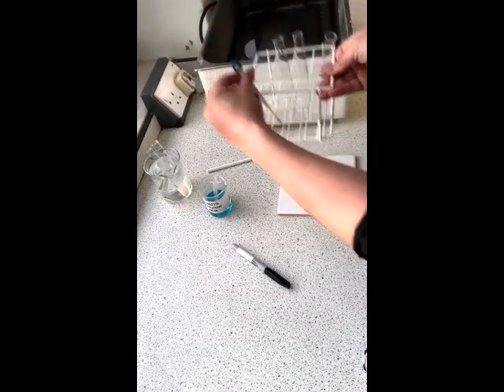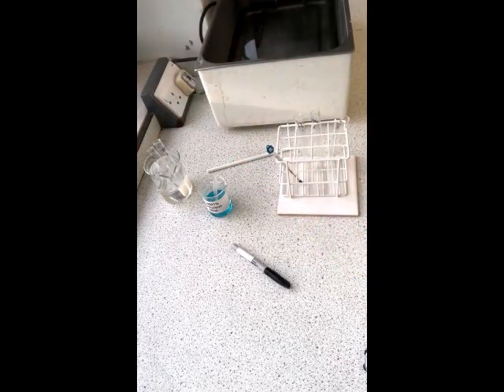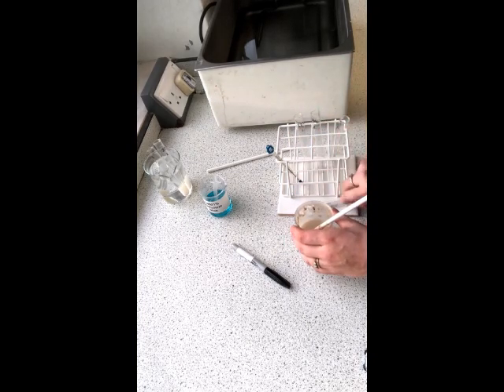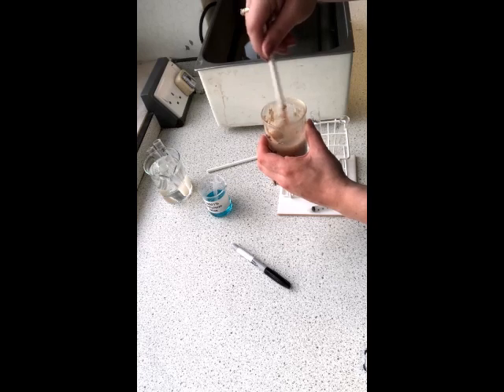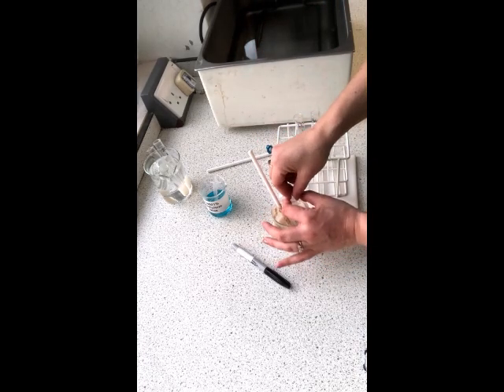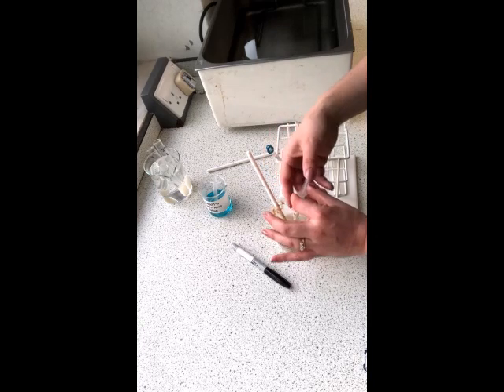So you can see the cradle is there. We will put the whole of this in the water bath. Let me get the yeast. Same system again. We're going to use a dedicated syringe for this. We're going to make sure that we have thoroughly mixed in case it has settled again, so that we get evenly distributed yeast and hopefully even samples. And we are going to measure out our 2 centimetres cubed.